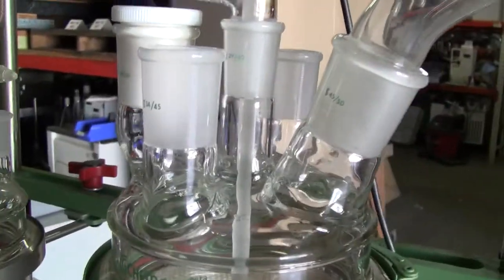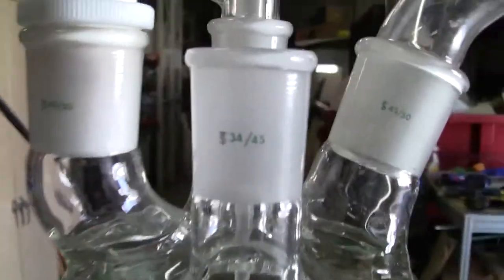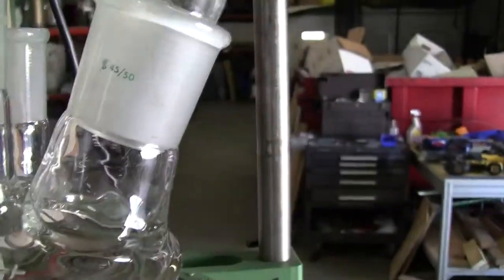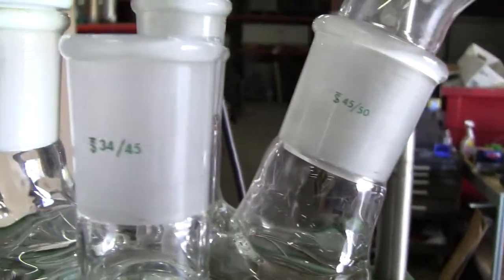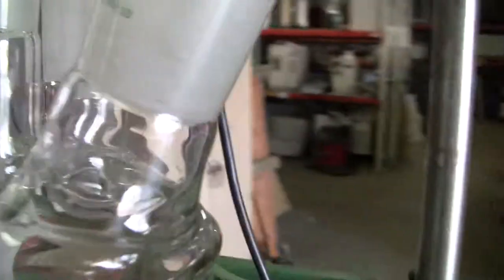There's the top. It has five ports on it. Two ports are 45-50, two are 34-45, and the middle port is 29-42.